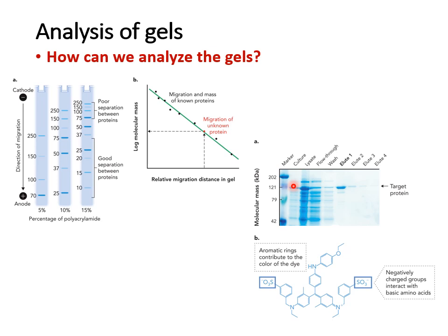And you'll be able to say, okay, my target protein is around 121 kilodaltons. So if my marker has the 121 kilodalton line over here, in my sample lanes, I'm going to be looking in that area. Okay? And that's always very important to have.